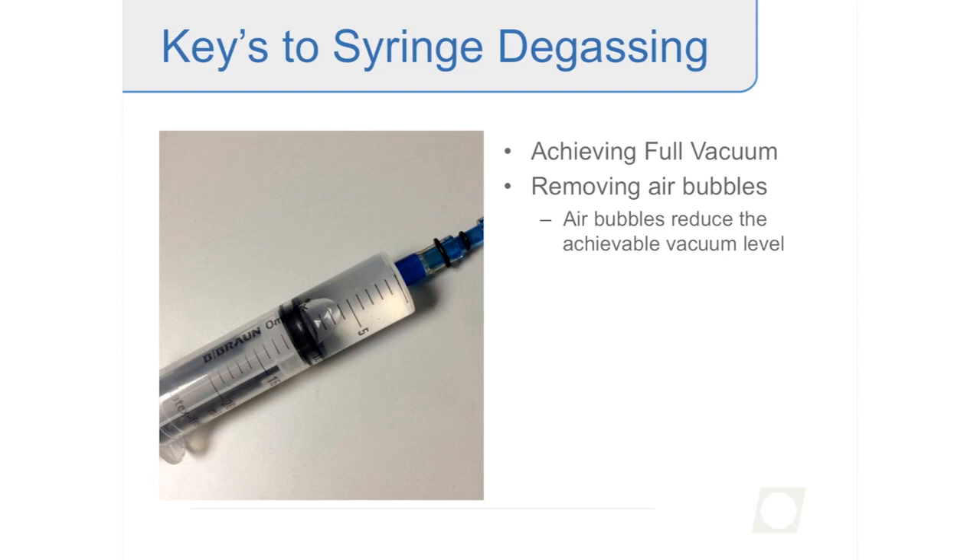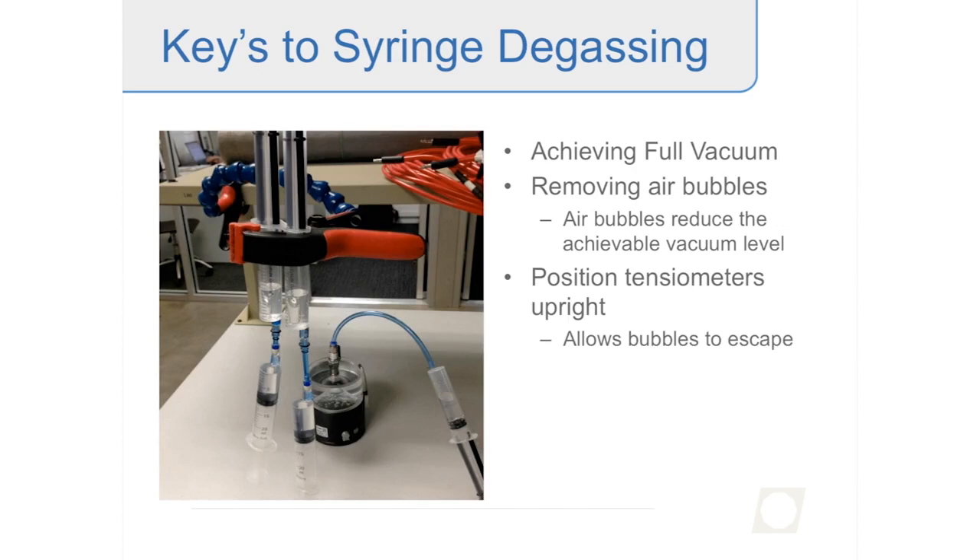You have to go through the process of applying vacuum, releasing it, and removing any air bubbles. It usually takes a few times of applying the vacuum, reconnecting, and removing air bubbles. When you do that, it gives you the ability to go beyond the normal measuring range of a tensiometer. Positioning the tensiometers upright with the ceramic pointing down allows bubbles to escape more easily.